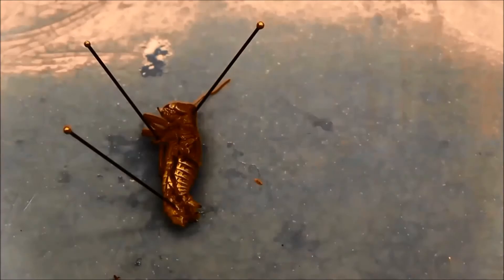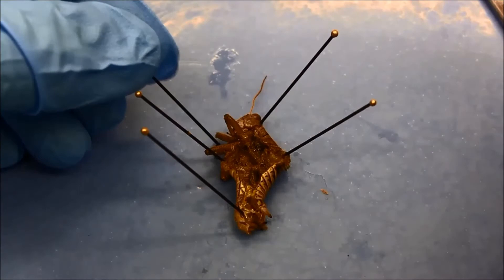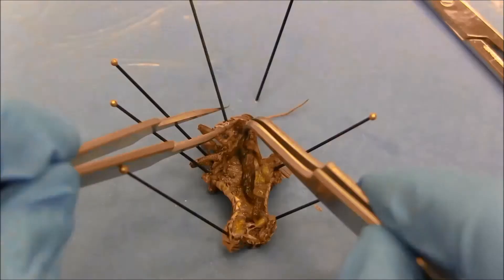I open the internal cavity so that I can see the digestive system. You can also make an additional cut if needed. Then I carefully pull out the digestive system.